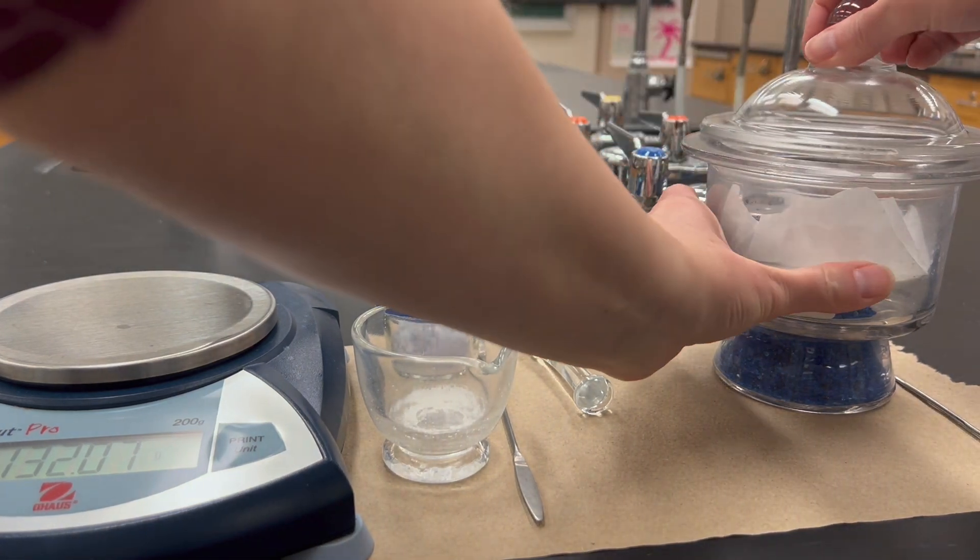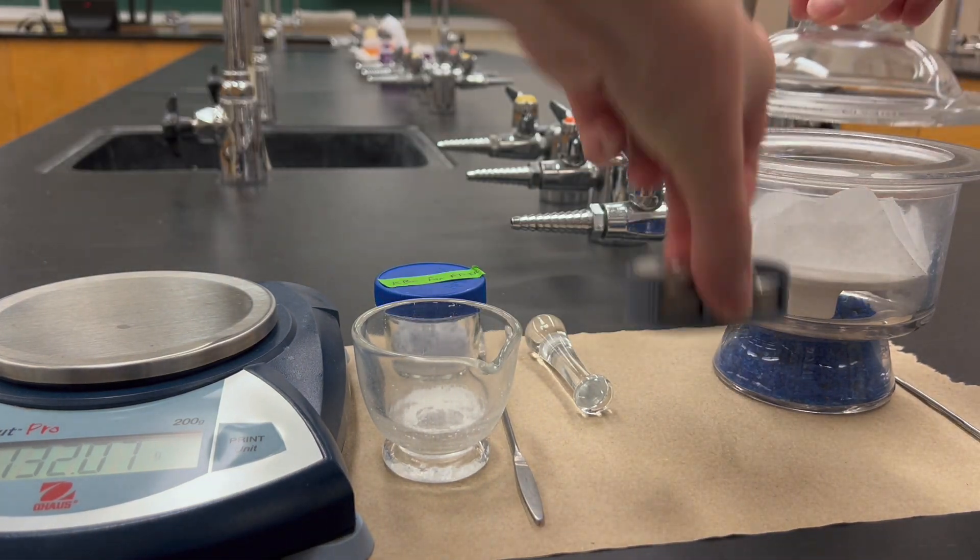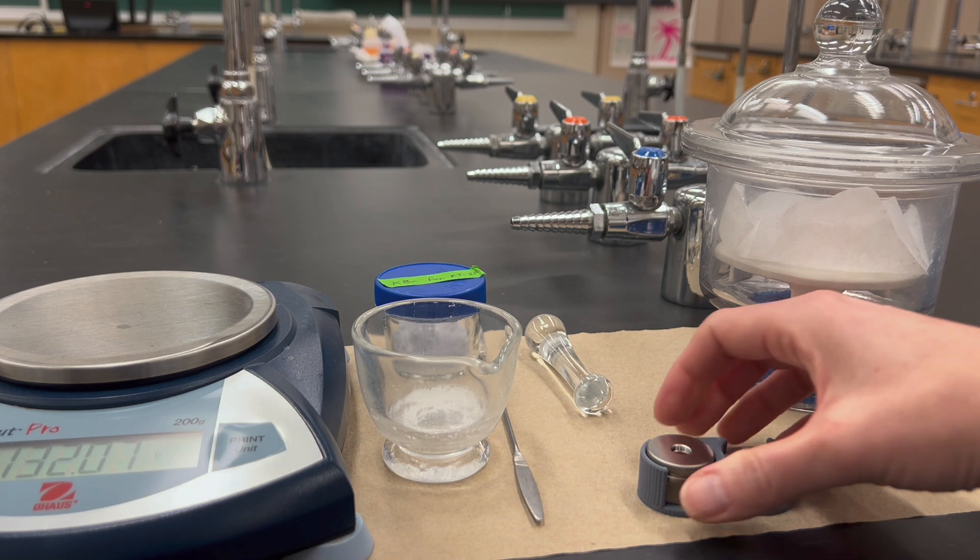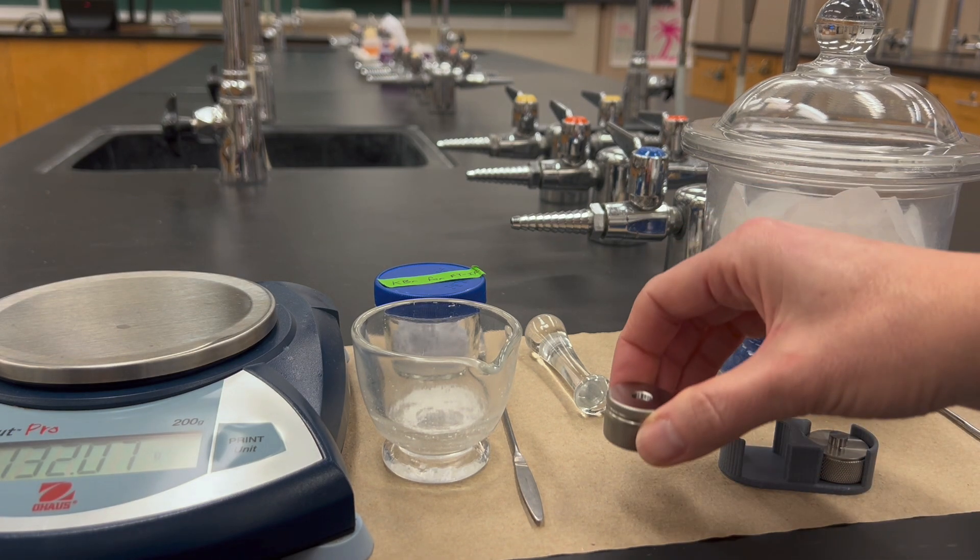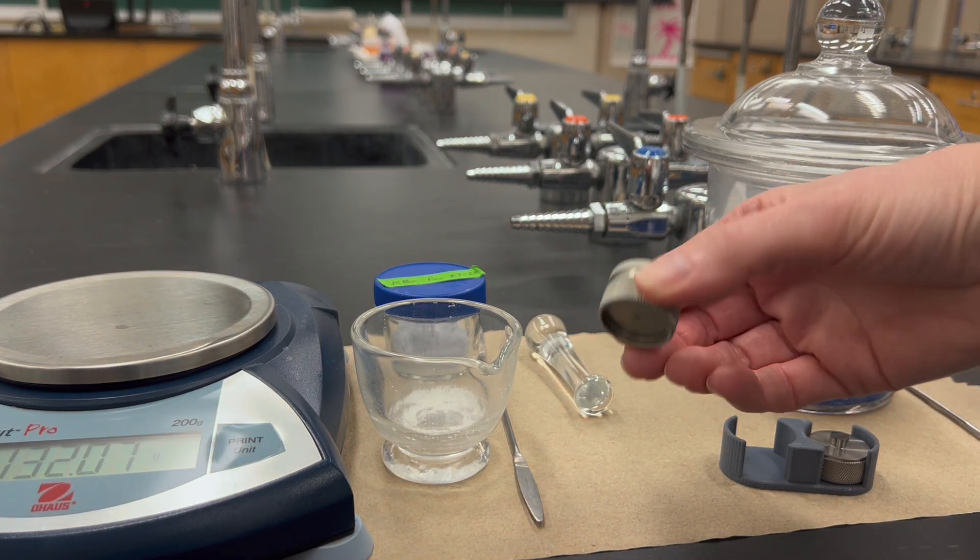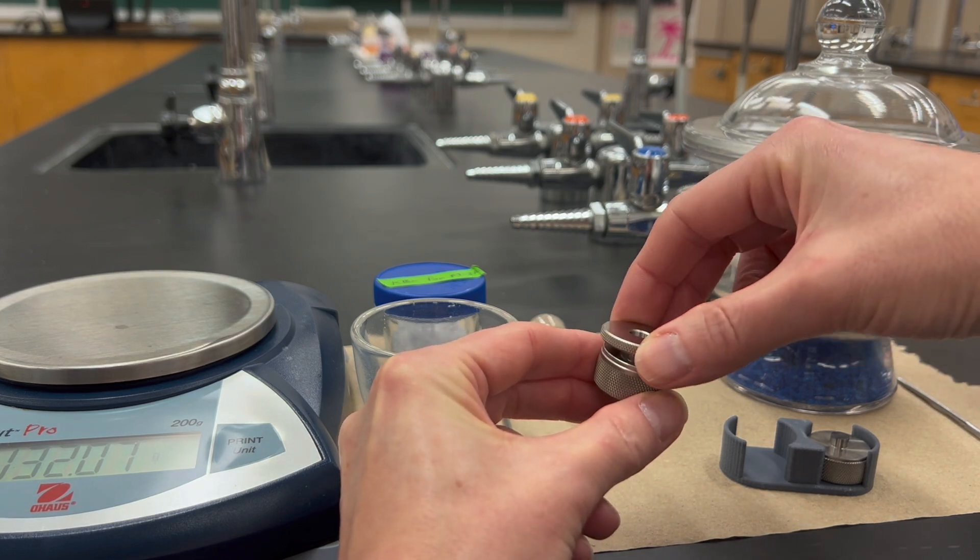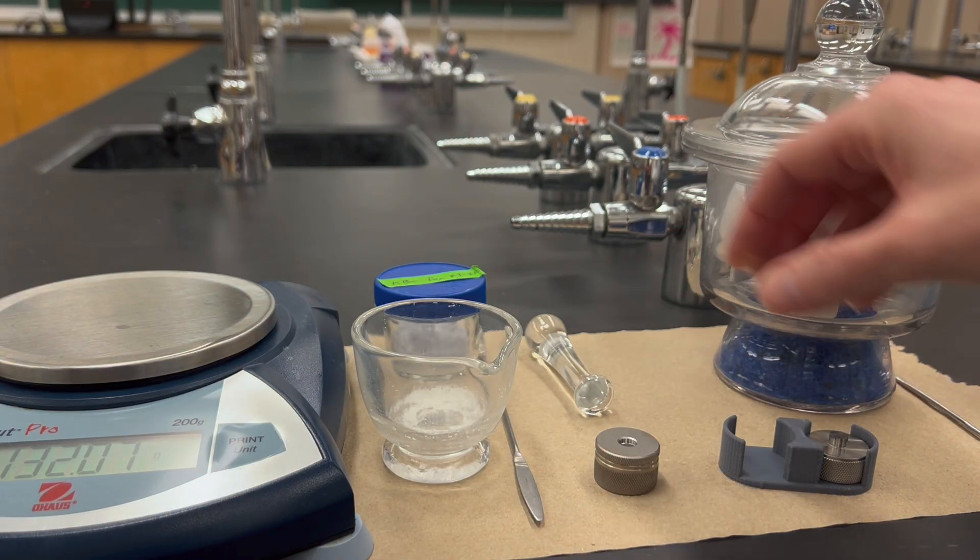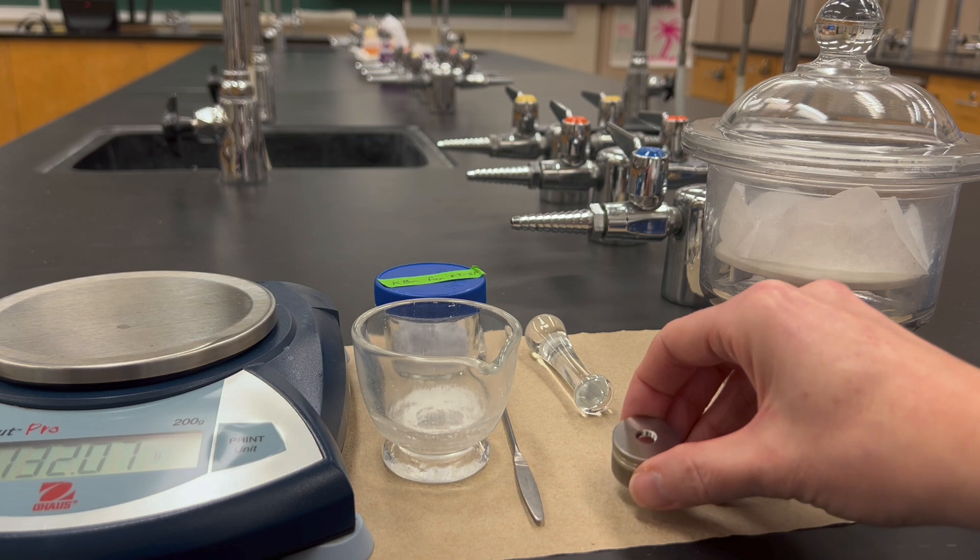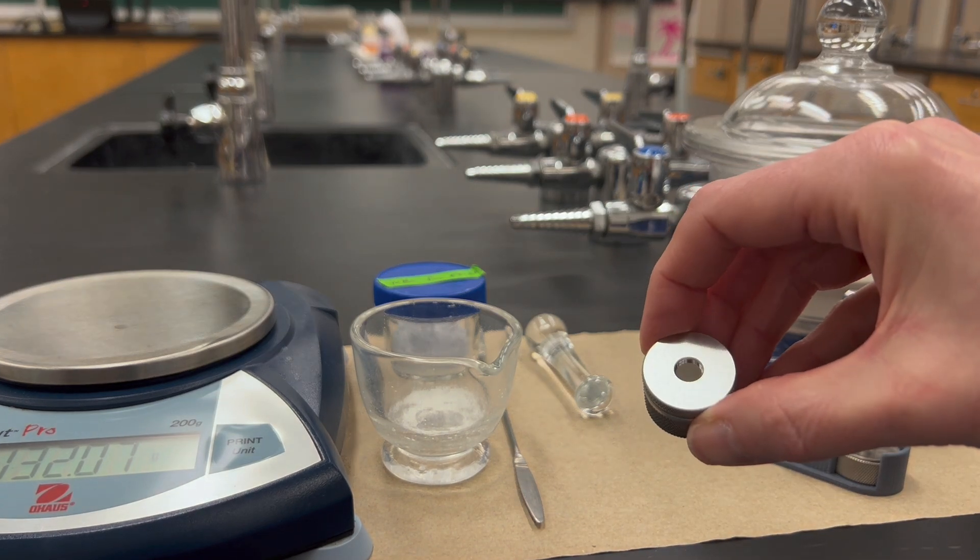Next, we have these little—they're called anvils—things that will hold the sample, and we keep those in the desiccator as well. You want to first take the part that has these two pieces, and it actually has a little indent in the bottom; that's where the sample is going to go into that little hole.